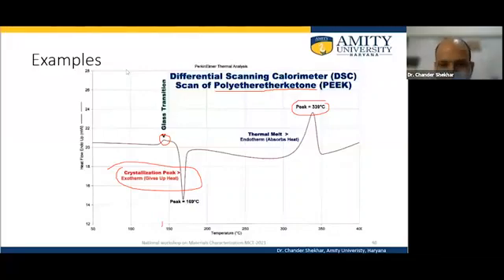If it is less, we can use a little more sample, but not beyond the capacity of the crucible, and it should not expand and spill over. If the sample doesn't expand during the temperature program, the amount can be increased so that the thermal energy exchange is greater than the sensitivity of the instrument, and then it can be detected.